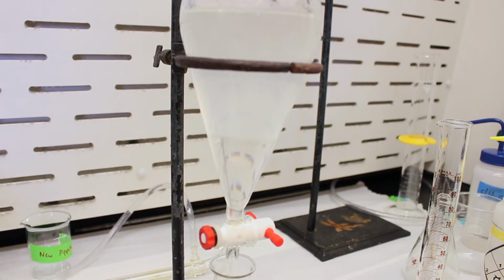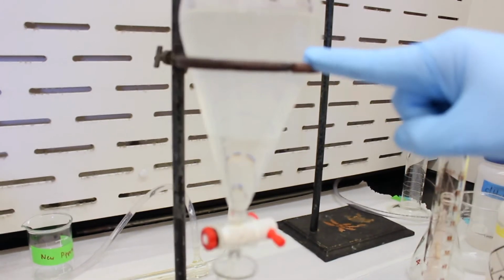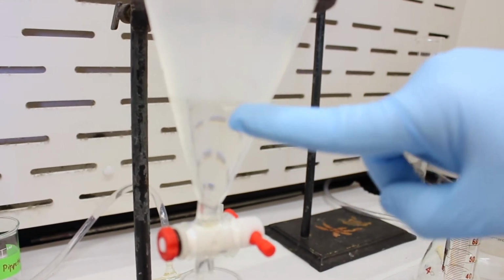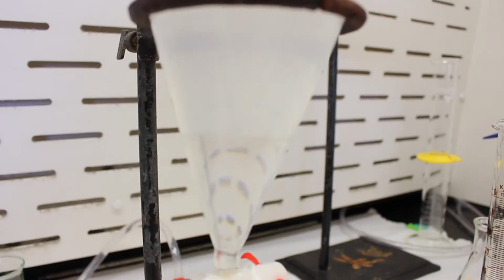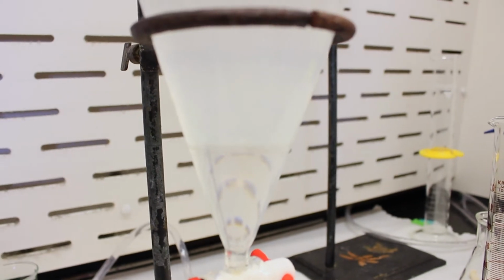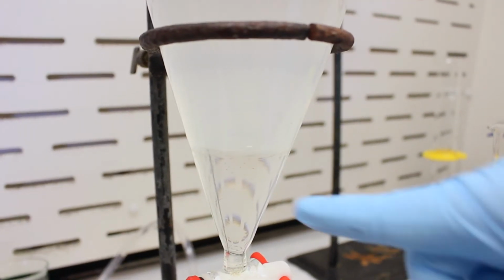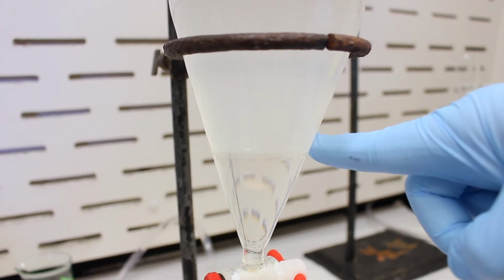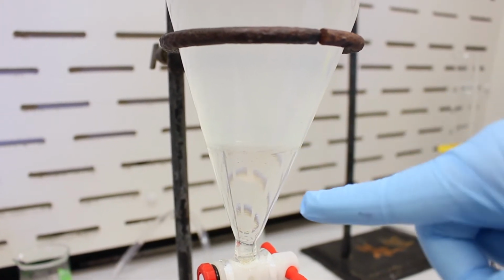Okay, so you can see the 2 layers have formed. On the top is the water with the eugenol, and on the bottom is the DCM. Here at the interface, you can see where the 2 phases meet, and you can see some dichloromethane trying to get to the bottom. Now, if we just left this here, there wouldn't be very good extraction. So we need to agitate the solution in order for the extraction to proceed.